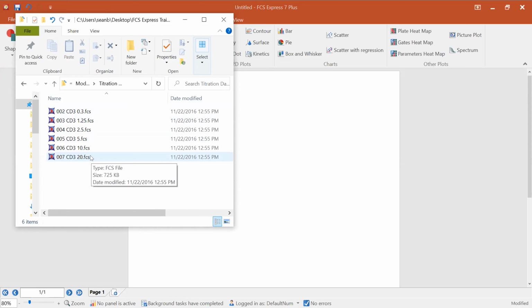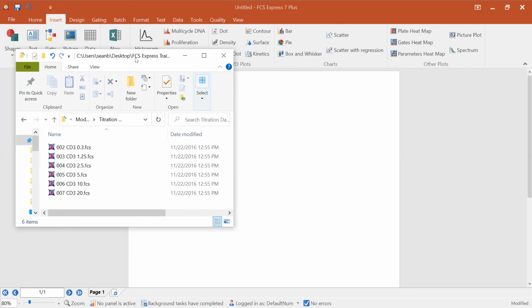And the other thing I should note about antibody titrations is if you're not doing them, you probably should, right? So if BD comes in and says you need 20 microliters of antibody to run the experiment, that's their best guess, right? If you do an antibody titration and you find that you reach saturation at 10 microliters of antibody, well, then your antibody goes twice as far and you save twice as much money when you actually use those antibodies and run that experiment. So I'm sure the core facility can help you figure out how to do antibody titrations. But I know with other software, it's actually pretty difficult to do these things.